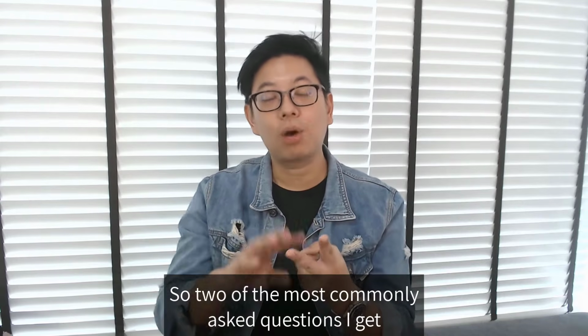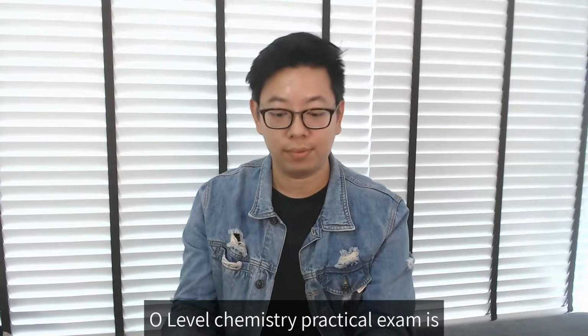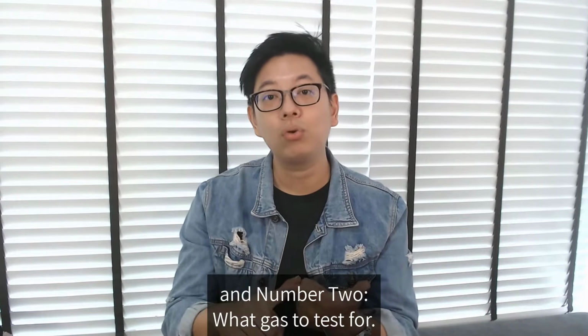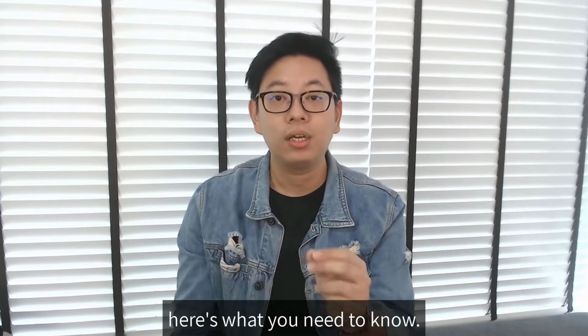So two of the most commonly asked questions I get when students are preparing for the O-level chemistry practical exam is number one, how to know when to test for a gas, and number two, what gas to test for. Now if you've ever asked yourself the same question, here's what you need to know.